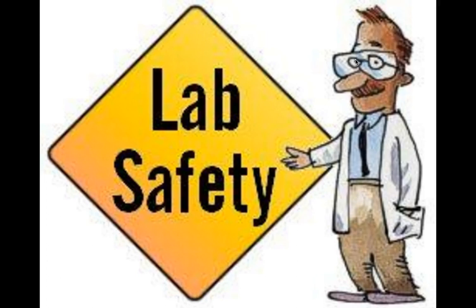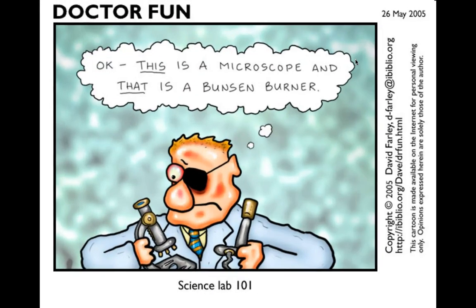So, general lab safety — this is part one. There's a cartoon I like: it shows a microscope and a Bunsen burner, and the person lost an eye — they probably thought the Bunsen burner was the microscope. You might think you would never do that, but it just goes to show that you need to be careful in the science lab. It's very easy to do something and not realize it's dangerous.